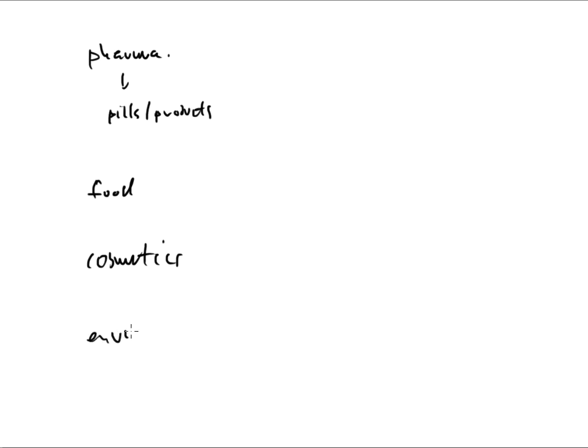Another LOD is environmental. All right, so as you can tell, environmental will often deal with water and soil and air quality. So if we bring in a soil sample into a laboratory, and let's say that we are a grower and I'm growing some type of plant, and I dig up my dirt and I bring it into a lab somewhere and I say, could you tell me how much water my dirt's getting based on the different depths as I go down and down and down? Well, an environmental company could do that for a client if that's what you want it to happen. But there's many different reasons to do an LOD. Again, moisture, and that moisture is strongly tied to an environmental company.